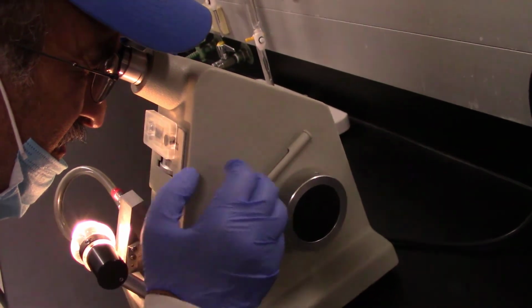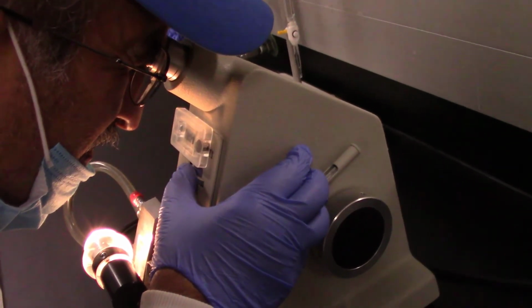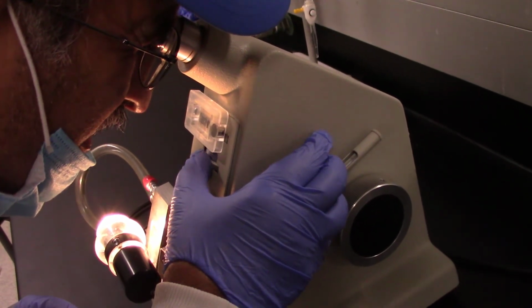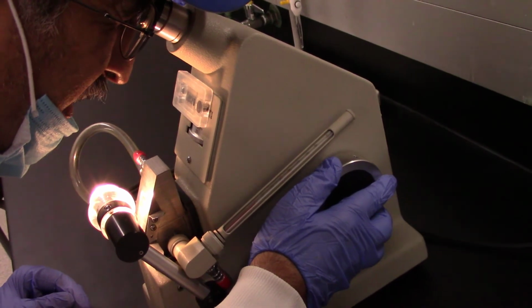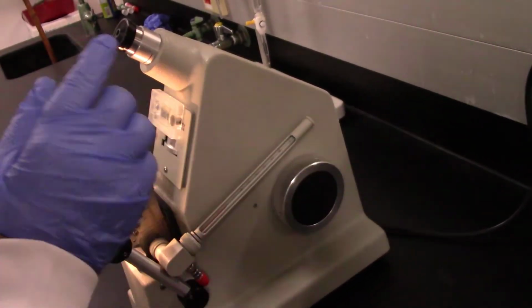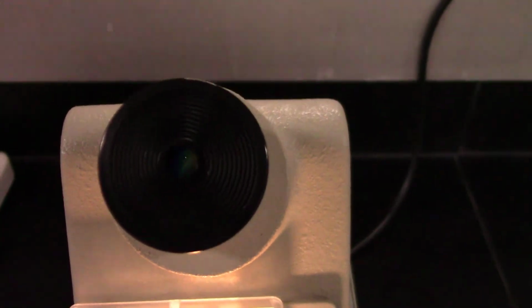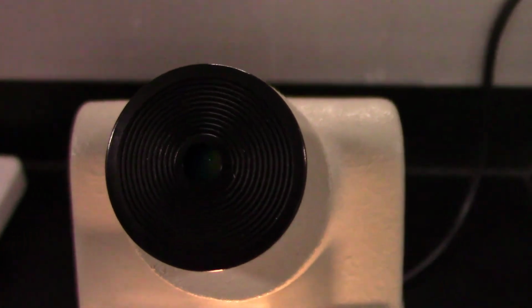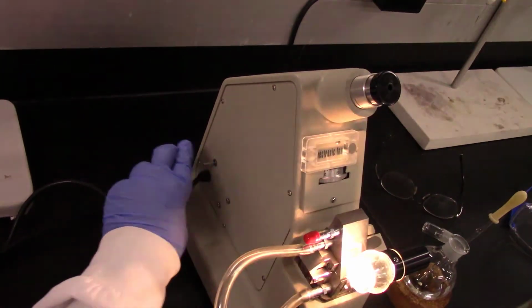That's what I'm doing right now, using this adjuster. This is the main knob that you can use to move the shadow up and down so that the shadow moves to the middle of the crosshairs. Now it's very difficult for us to show you what is going on inside the eyepiece. However, you have to basically just believe us.